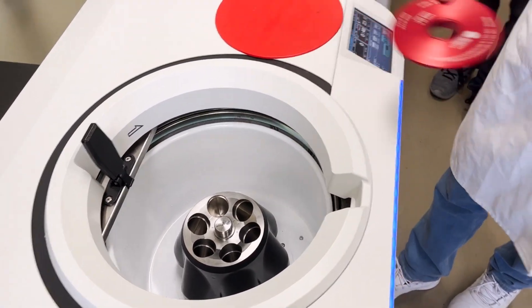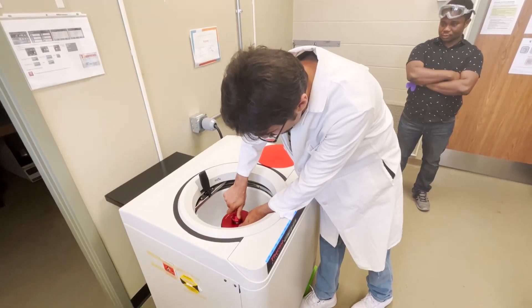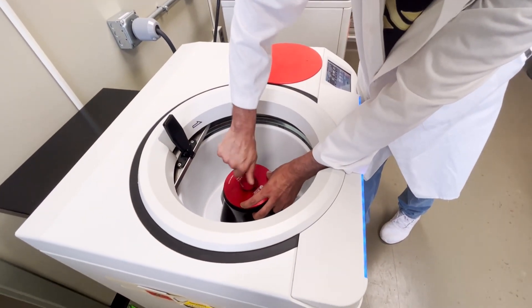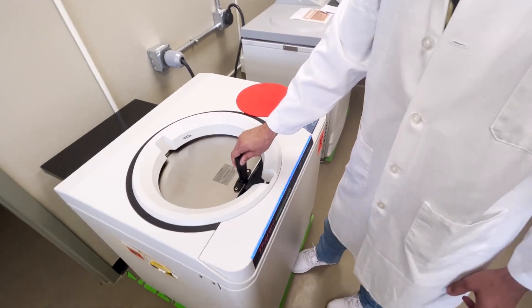Then you open it and put your sample in. Make sure this part is not loose — when you put your sample in, it should tighten all the way to the end. After you put your sample in, you close it.